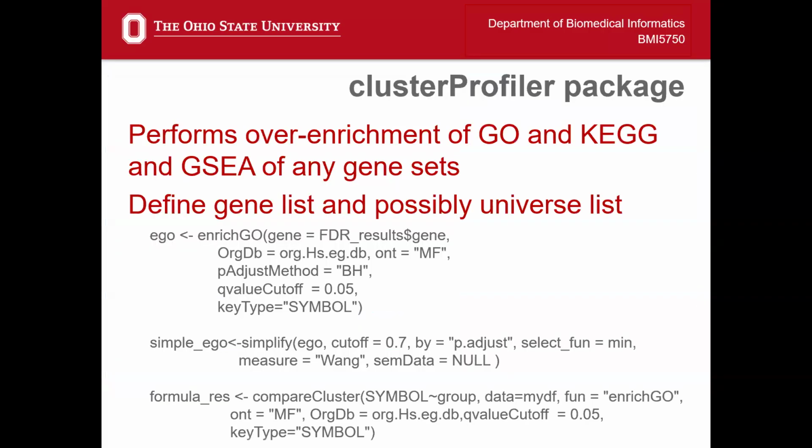Okay, what I like to use for over-enrichment analysis is the clusterProfiler package. You can perform over-enrichment of gene ontology and KEGG. You can also do gene set enrichment analysis, which we're going to talk about in a few slides. But I will show this in the code.